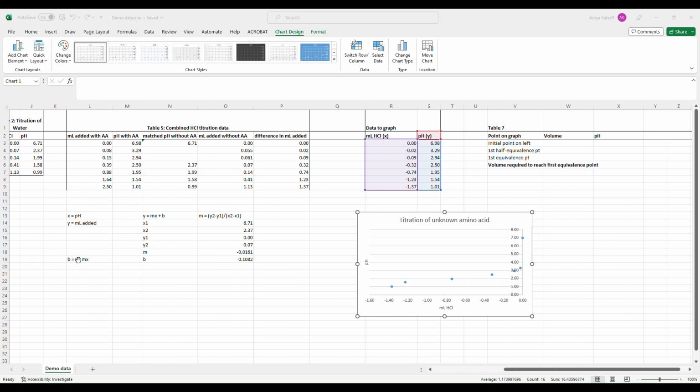So just to refresh everyone on what those mean, let's go back to our idealized curve over here. I will actually erase and we can begin again. So the very steep slopes on this curve, the halfway points of those are going to be your equivalence points. So you'll have one here, you'll have one here, and you'll have, theoretically, one kind of over here in the corner.